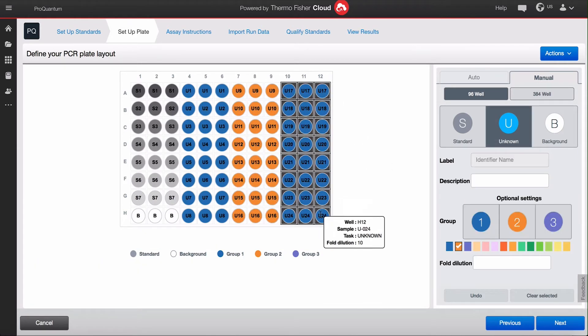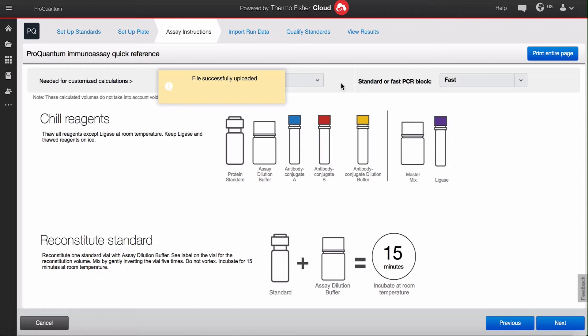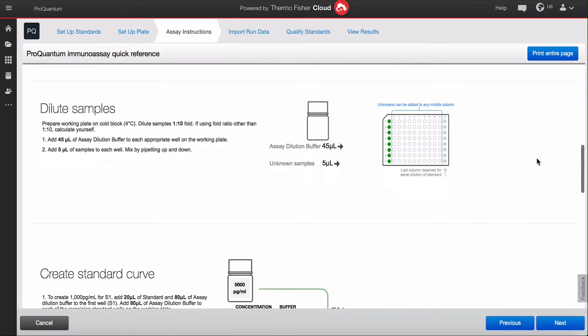Designate groups by color for any downstream statistical analysis. Once complete, save the plate layout. Get customized lab bench instructions based on your standard and plate designs. We'll use five microliter assay volume per well in this example.